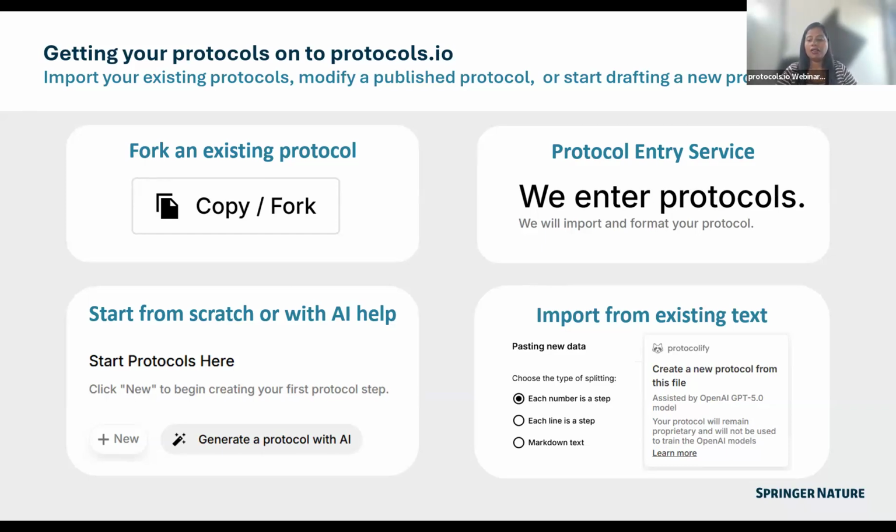And if you already have a Word document or PDF of your protocol, and you want to transfer that to our platform and don't want to write it again, we have an AI importer called Protocolify. There you can just put your PDF, Word file, or image file. It will extract all the information and transfer it to the steps. So that is also a very useful option we have to save your time.